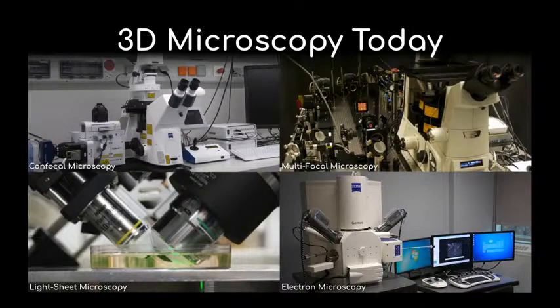And of course, electron microscopy gives us unprecedented spatial resolution at the expense of a very low signal-to-noise ratio. So basically, the message communicated in the slide is that there is a vast variety of 3D imaging techniques. We have the means of generating this data that has the information that we're looking for in the context of image processing. However, the means of properly visualizing and interpreting this information is lacking, and that's what we seek to address with the tool that I'll present in the following slide.